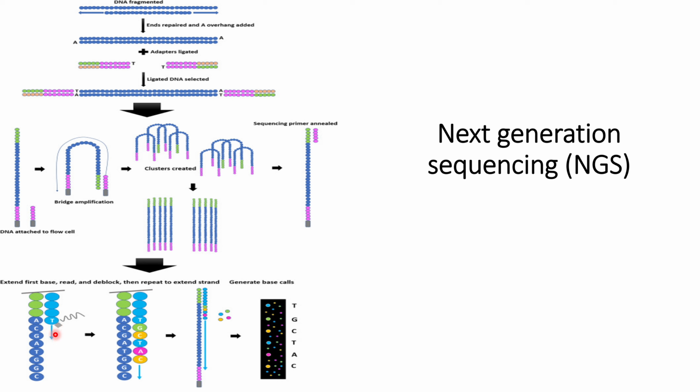After that, the same thing that we have discussed in the Sanger sequencing, that is, fluorescently labeled nucleotide is attached. The difference in this kind of nucleotide is that whenever it releases a signal, the dideoxyribose nucleotide will convert into deoxyribose nucleotide, so that after fluorescence is emitted and signals are recorded, the further sequencing of this DNA can take place, as can be seen here.